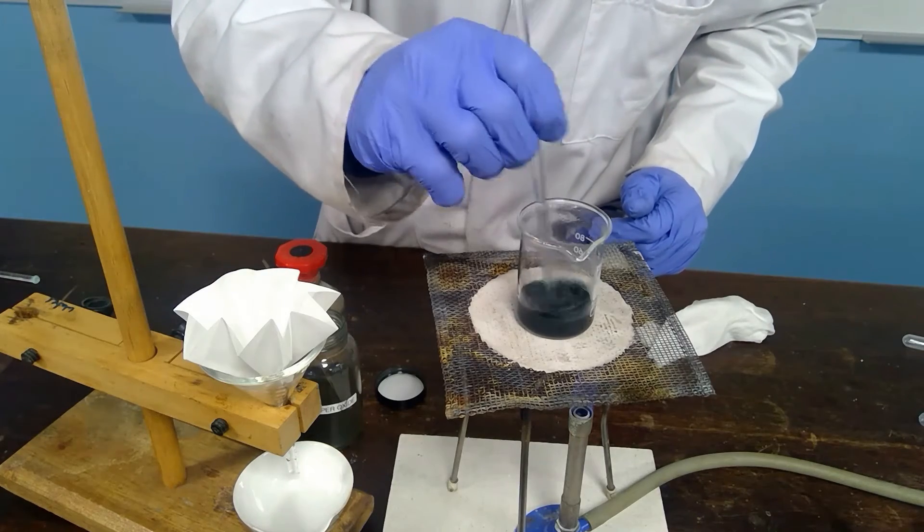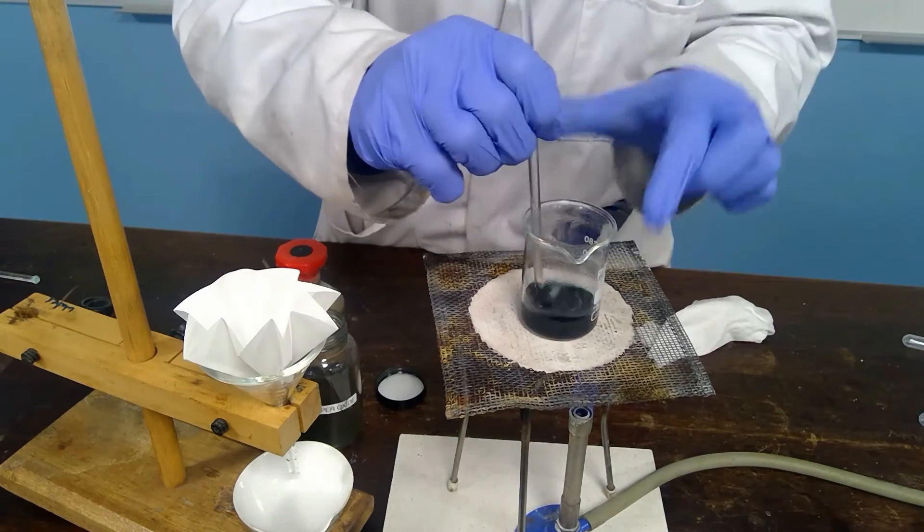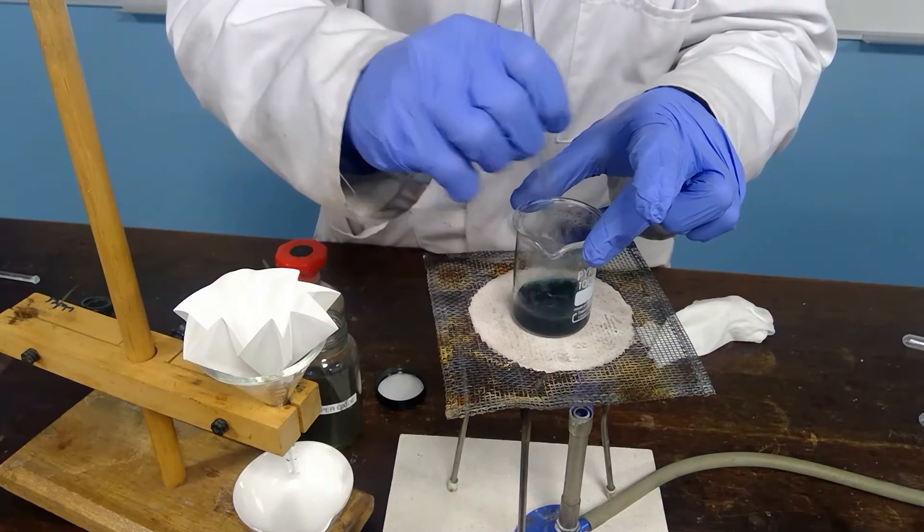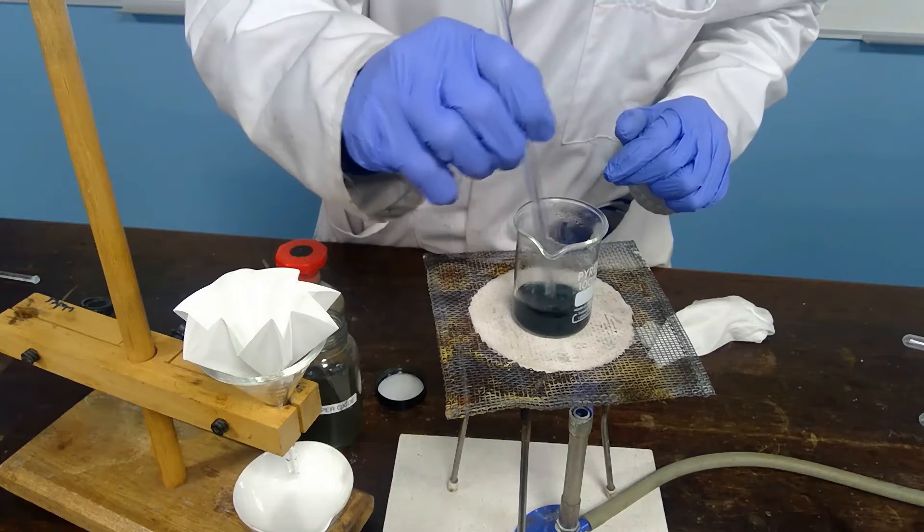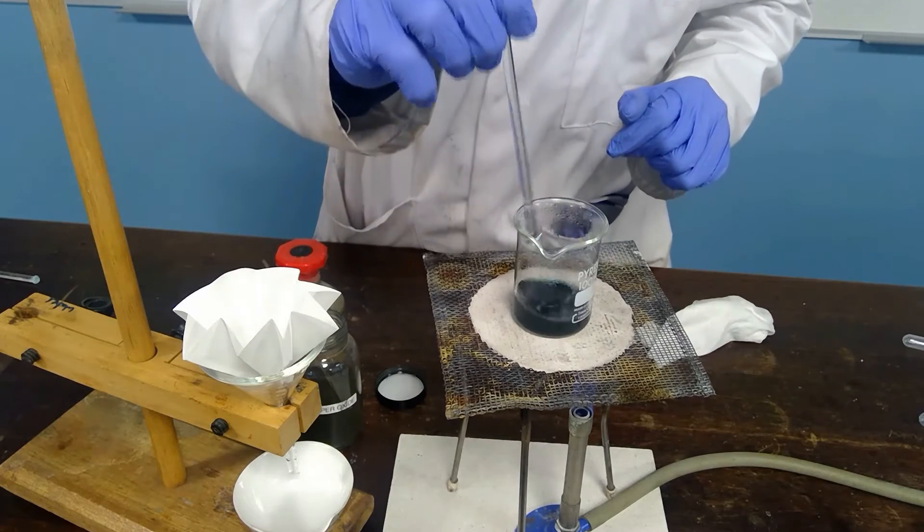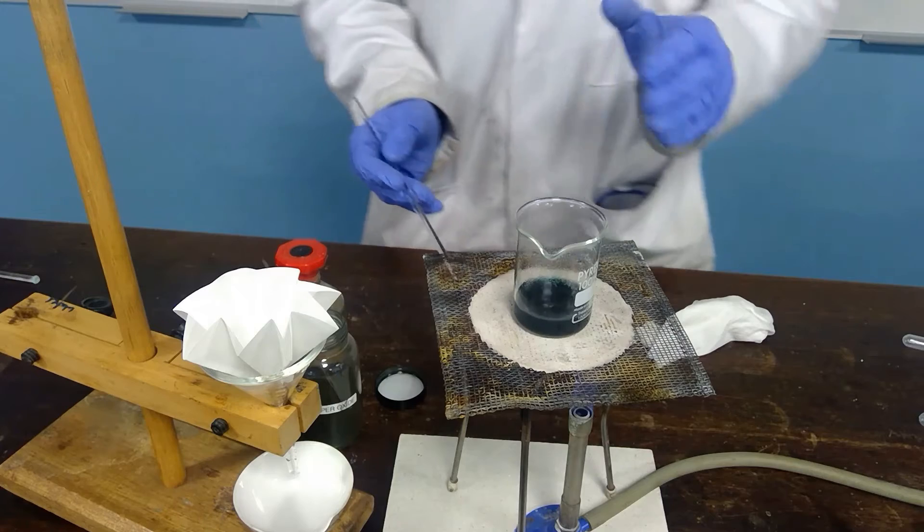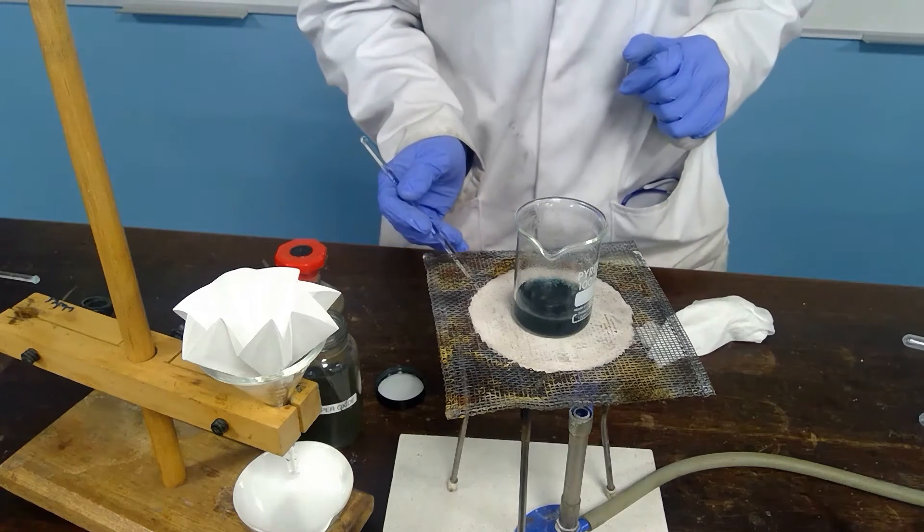You see that the black solid is not immediately disappearing despite the heating. And so this may be the point at which we have an excess of copper oxide. So we know that all the sulfuric acid on the assumption that this doesn't disappear. We know that all of the sulfuric acid will be neutralized because we have an excess of copper oxide.